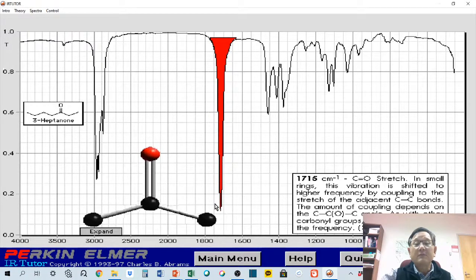There is a strong peak here, which is representative of the carbonyl peak, the C=O double bond stretch. This is what you have seen in the adhesives. Some of them have a 1700 peak, some do not, and this has something to do with the distinct vibrational spectrum around the carbon ketone.